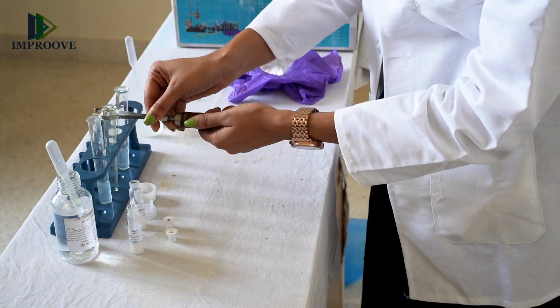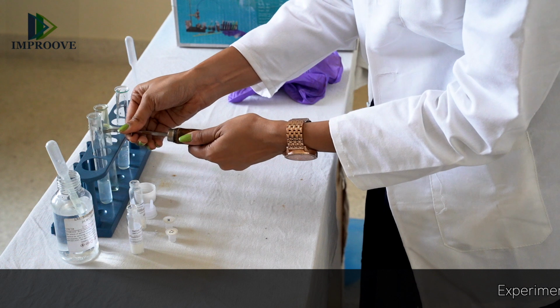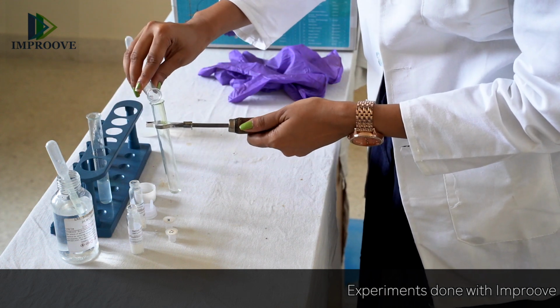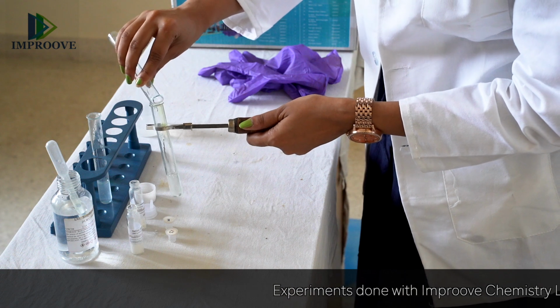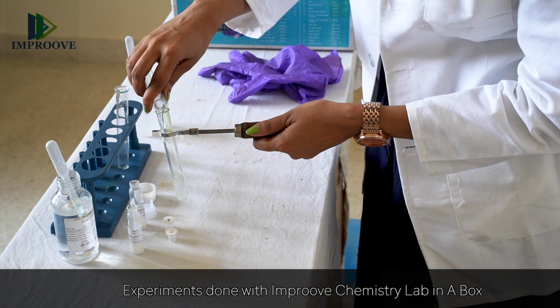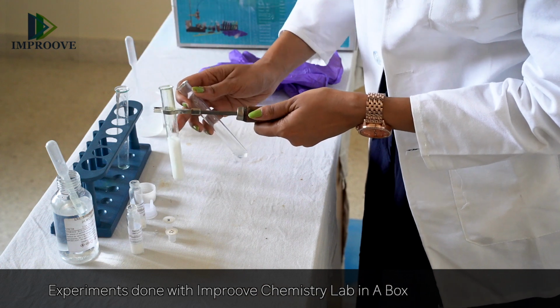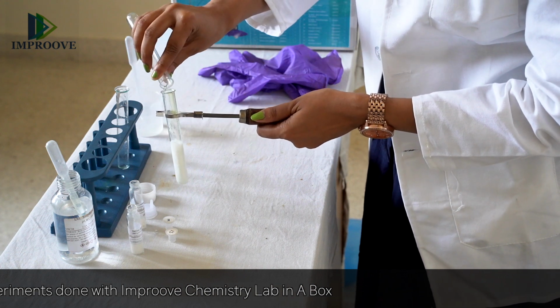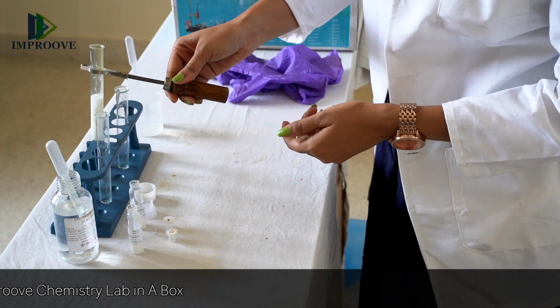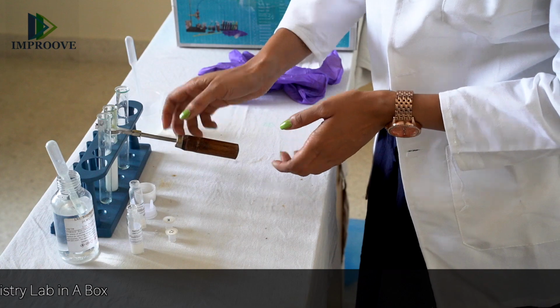So take the third test tube, and in this test tube pour the 2 solutions, mix them together and notice any change. You would see immediately a white precipitate is formed, and allow this test tube to settle down so that the precipitate settles at the bottom of the test tube as a sediment.